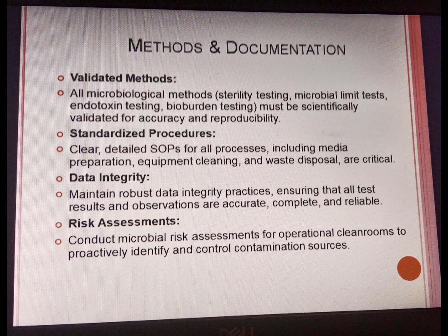Data integrity. Maintain robust data integrity practices, ensuring that all test results and observations are accurate, complete and reliable. Risk assessment. Conduct microbial risk assessment for operational clean rooms to proactively identify and control contamination sources.